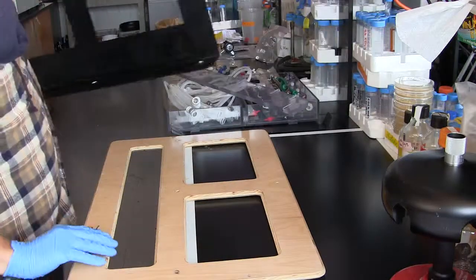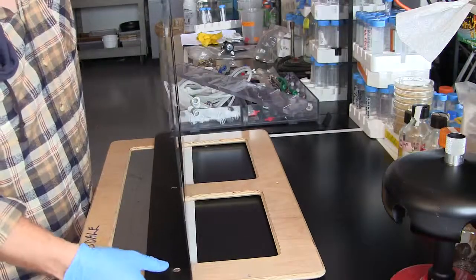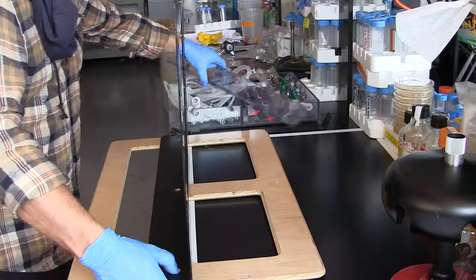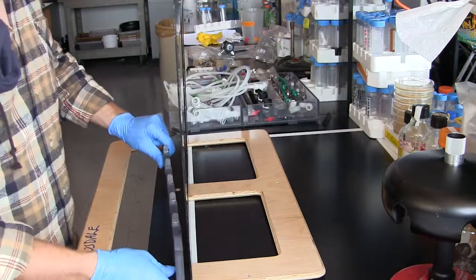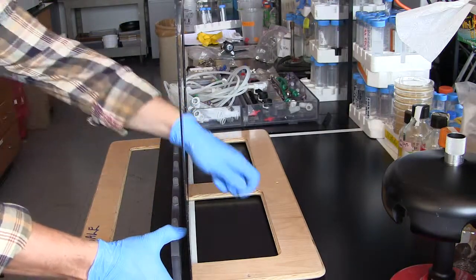Make sure that your base plate has a hole to the back. You then put the back plate on, lining up with the holes that run down the length of this centerpiece. Then you put the thing the Niskins rest on top, and essentially this holds everything together.